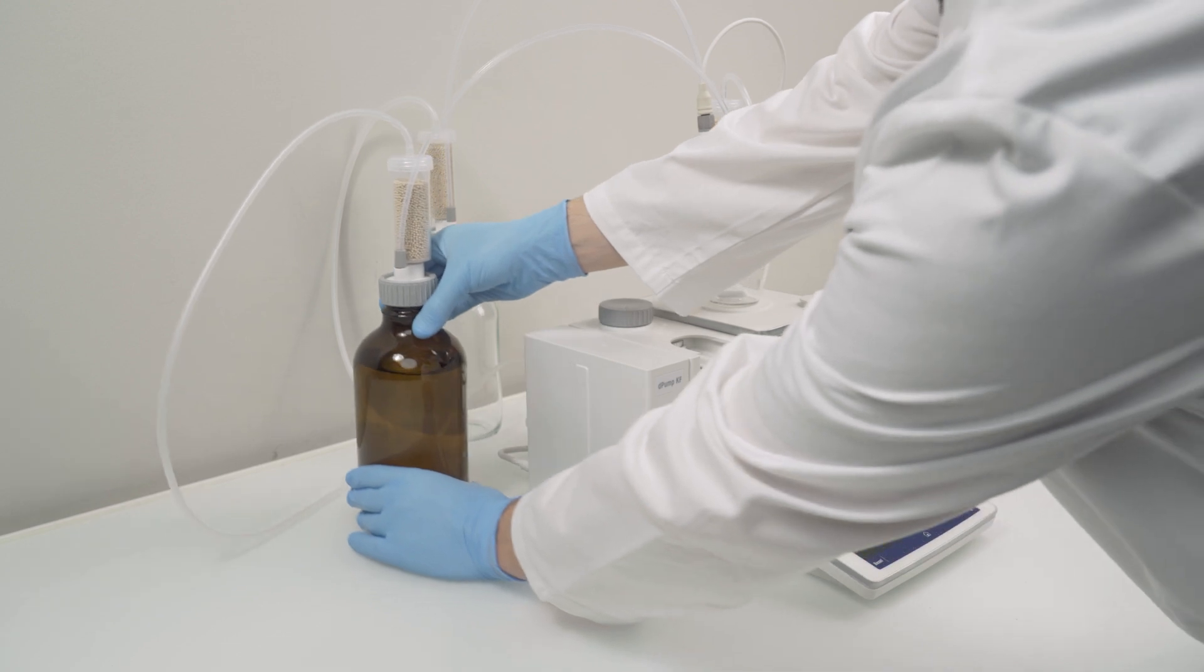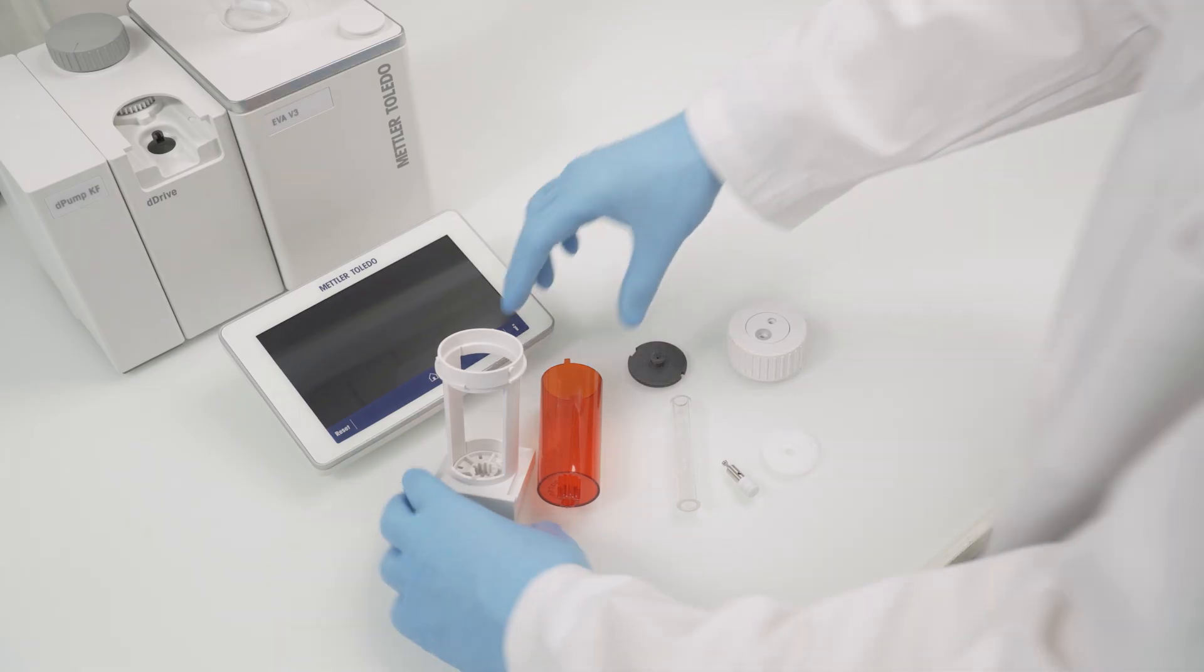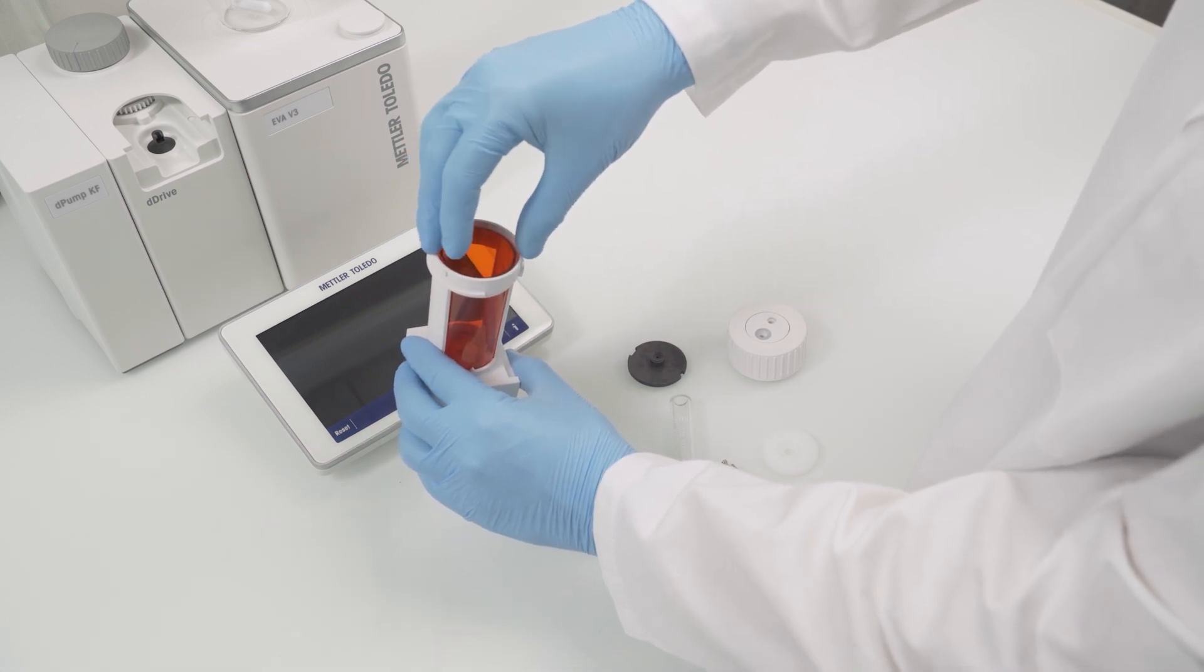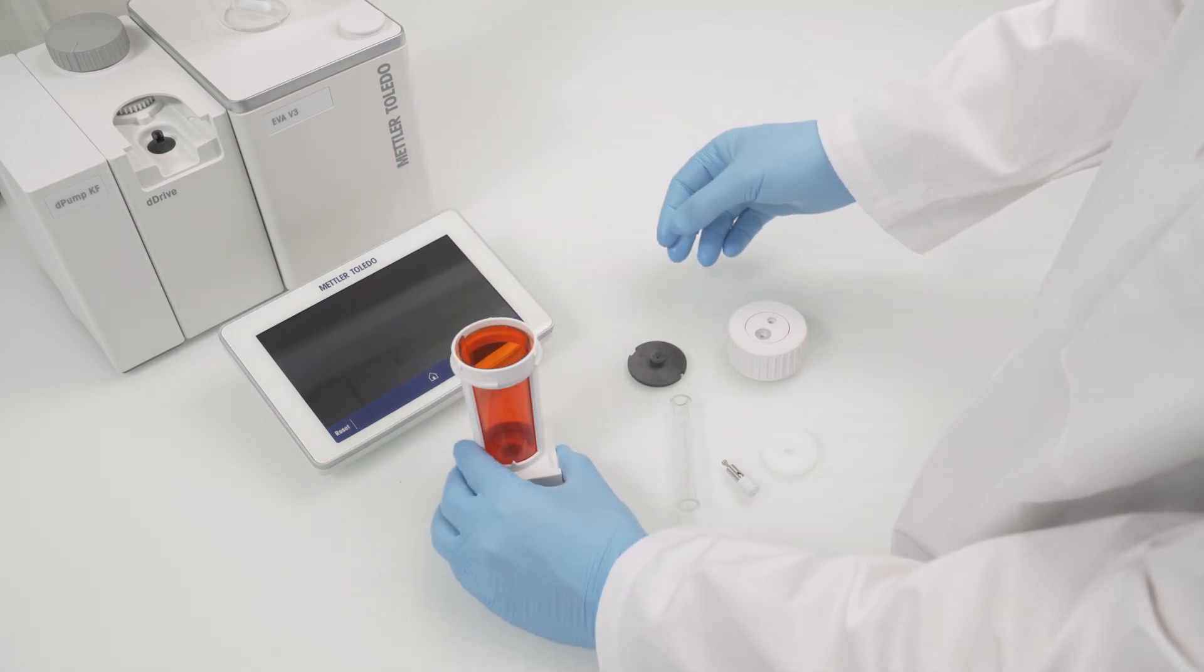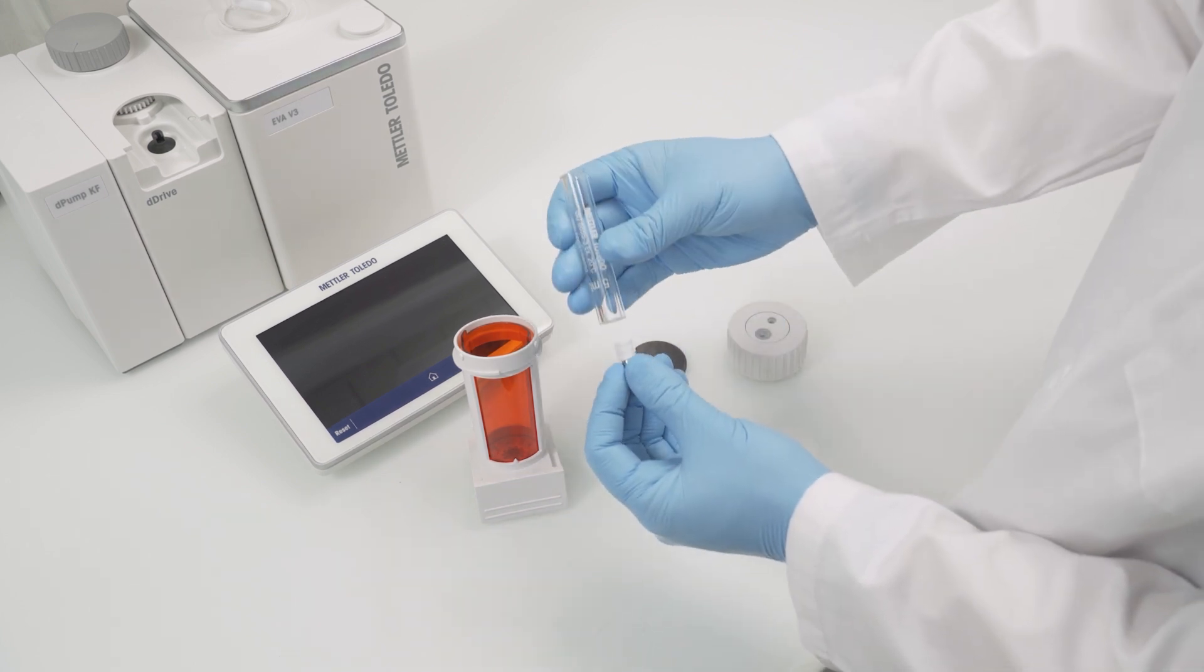Move the solvent bottle to the back. So we have enough space for the assembly of the burette. Put the red rotary encoder into the burette housing and turn it slightly until it falls down.